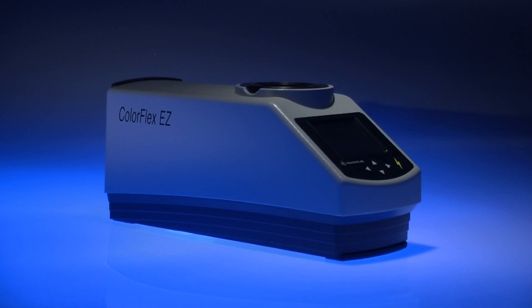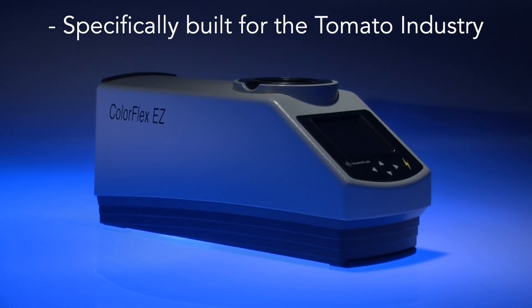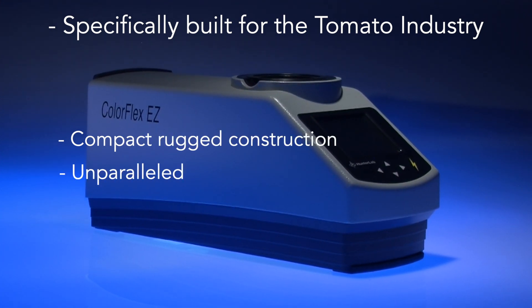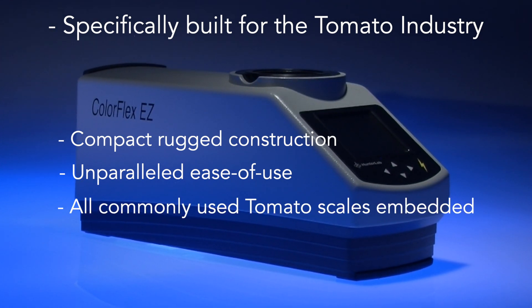Hunter Labs ColorFlex EZ Tomato is specifically designed and built for use in the tomato processing industry. With its compact, rugged construction and unparalleled ease of use, the ColorFlex EZ is embedded with all the measurement scales commonly used in the tomato industry.